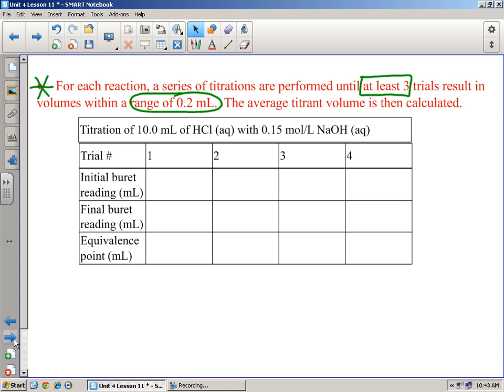But very common. Here's your burette. It's got 0 at the top and 50 at the bottom, so it's a 50 milliliter burette. There's bigger ones, there's smaller ones, but 0 to 50 is in milliliters. Make sure you take note of all this and write down some notes for yourself today, because when we get there tomorrow, you have to be ready to go.